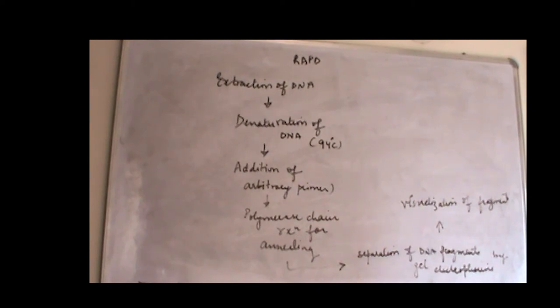After the attachment is done, a totally arbitrary primer has attached there. So what is its principle? Now what happens here? We have added the primer. This primer will go and attach at different loci or sites anywhere, and amplify from a complex and form a complex DNA template.